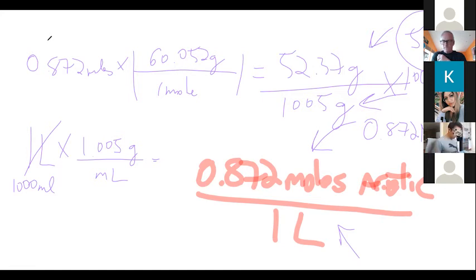Could we go over number 3 from the pre-lab questions? Oh, of course. So just remind me, what was the question? It says, for each of the above points, identify the ions and acids present and sort based on their relative concentration in the solution. Okay, let me see if I can pull that one up.